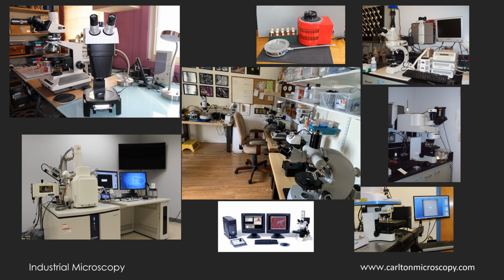In that process, I've had access to quite a few instruments, microscopes of various flavors and sorts. So I have stereo microscopes, polarizing light microscopes, thermal microscopy. I've used image analysis on both optical and SEM images. I've done infrared and Raman microscopy, as well as the electron microscopy, both scanning electron microscopy and TEM. The middle and upper left images here are of my laboratory and instruments at home.